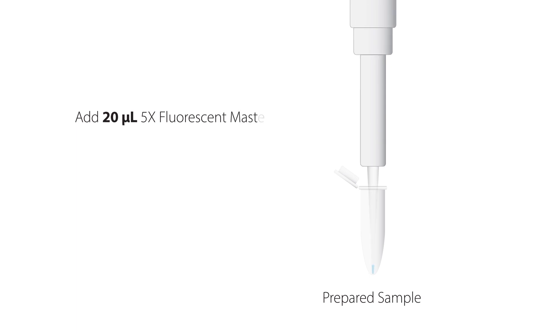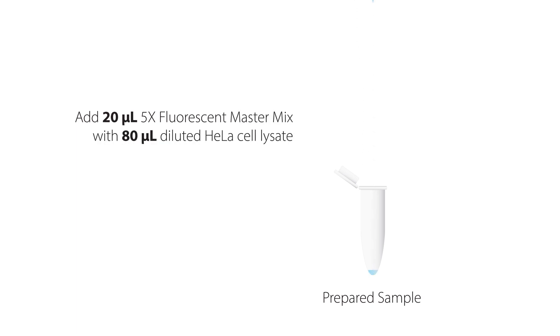Combine 20 microliters of prepared 5x fluorescent master mix with 80 microliters of your diluted HeLa lysate sample. Mix by pipetting up and down.